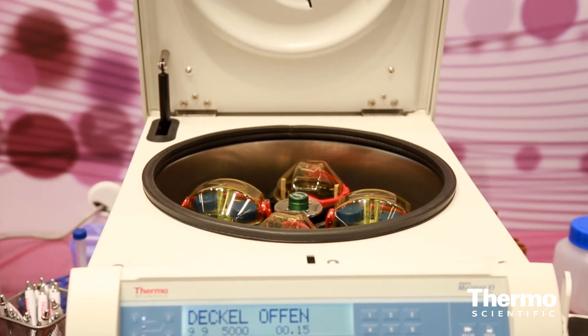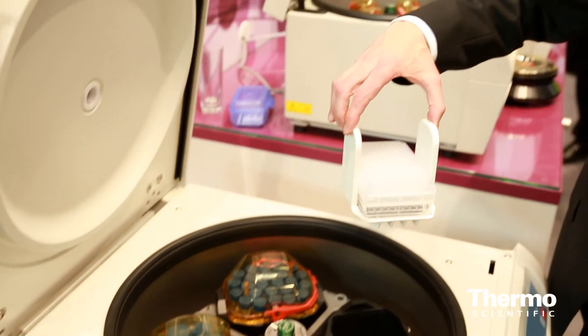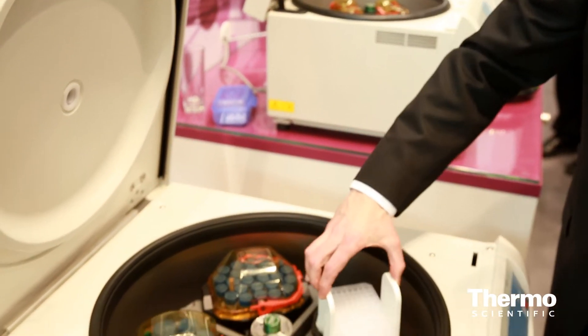We're now able to spin microplates directly in the bucket, so there's no additional buckets or carriers that you need to purchase. And that's 24 plates in one machine.